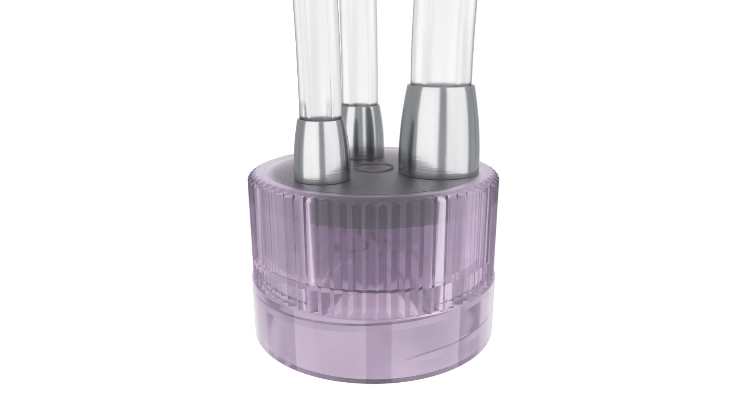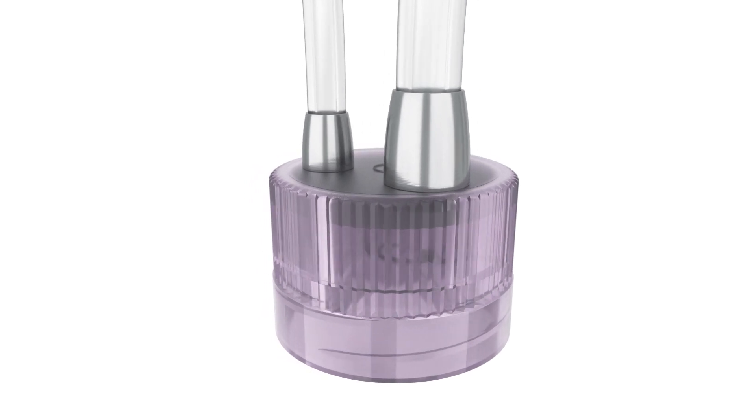MyCap bottle closures. Robust, easy, aseptic, and one-for-all.